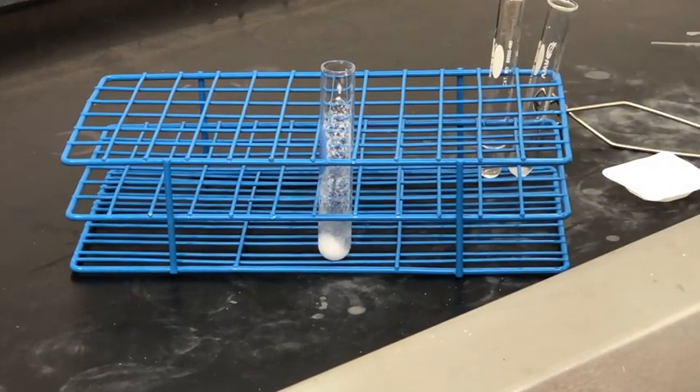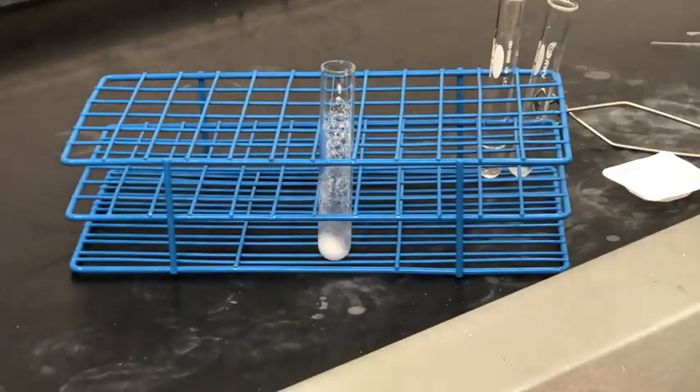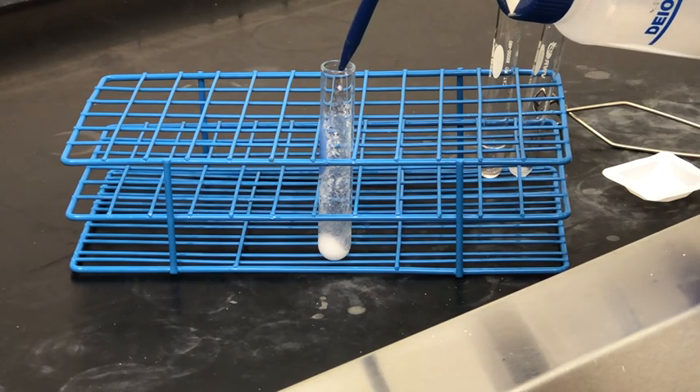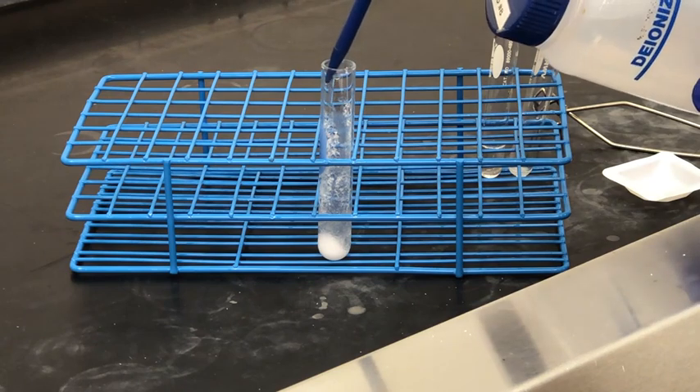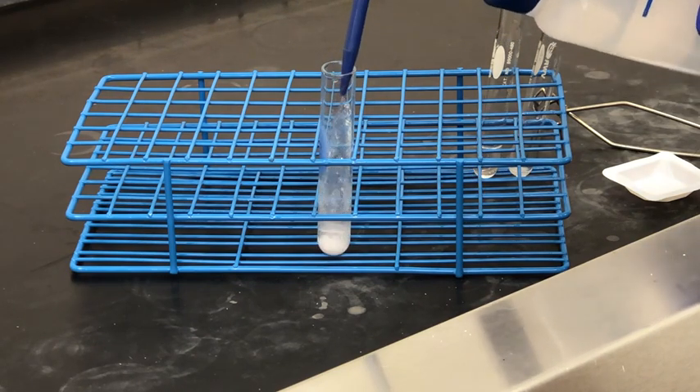Once all the liquid has been transferred we're going to set it aside, and now we're going to use some deionized water to rinse the sample. I'm carefully rinsing the sides of the centrifuge tube to make sure all of the solid is at the bottom.